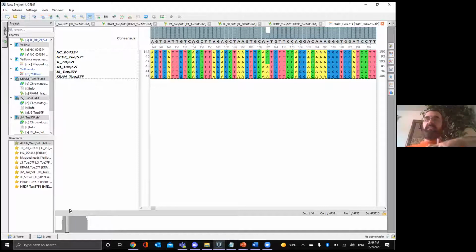That's correct. So there's a difference between your reference sequence and what, 3 of your sequence reads. But what is that, ATG or CTG? That's our, what do you call that sequence? That's where the mutation, not the mutation, the protein is missing. Now that's the mutation, right? So the C is the mutation. It should be ATG. What is ATG? What does that code for in a protein? The adenine, thymine, and guanine.